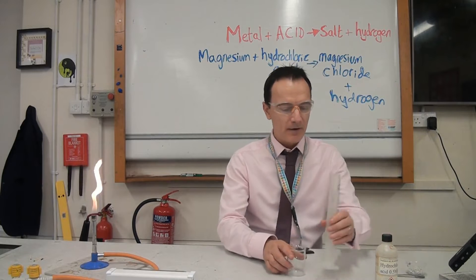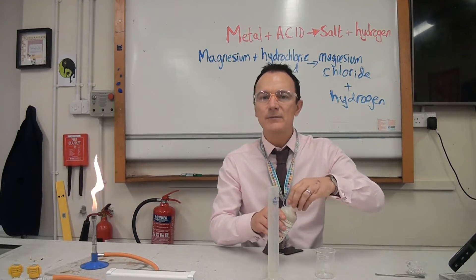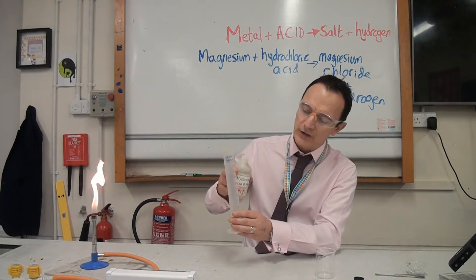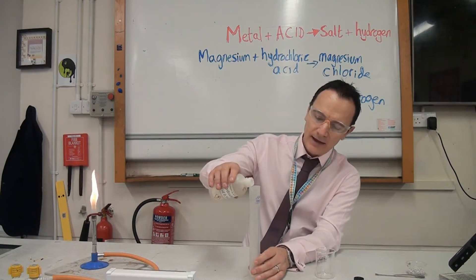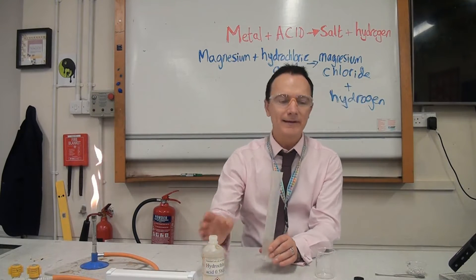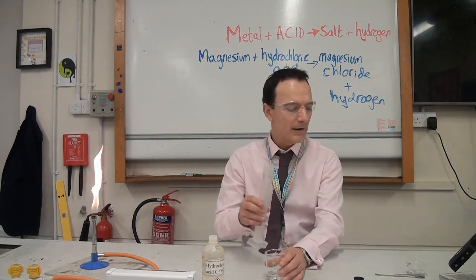The first thing you would do is measure out a known volume of acid. You could say 50 centimetres cubed or 60 — I'm going to say 25 centimetres cubed. So I'm measuring out 25 cm³ of acid into a beaker using my measuring cylinder.